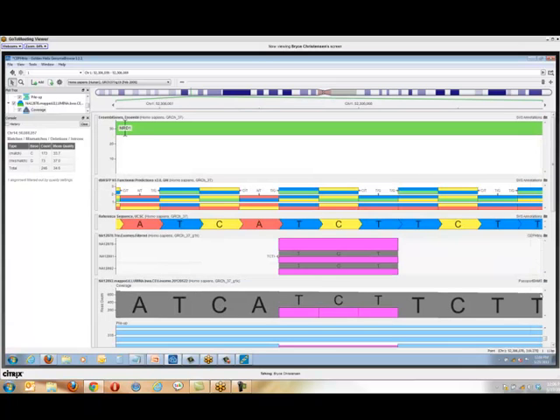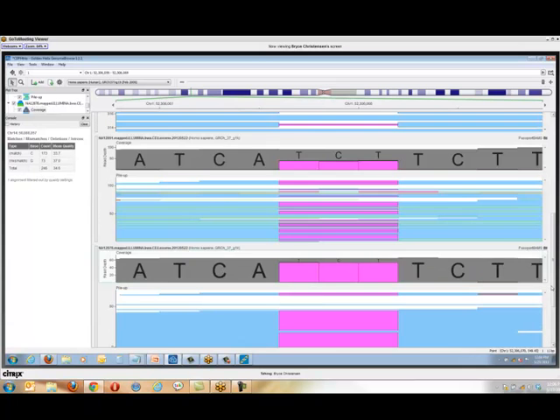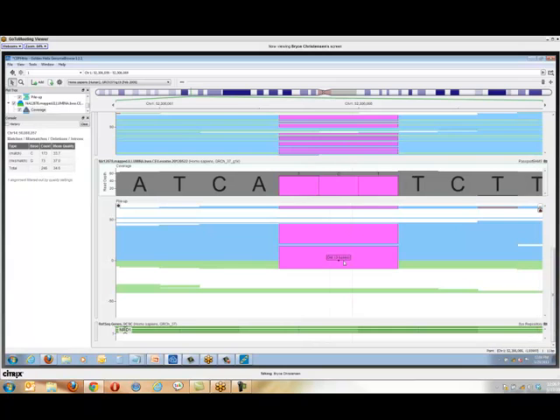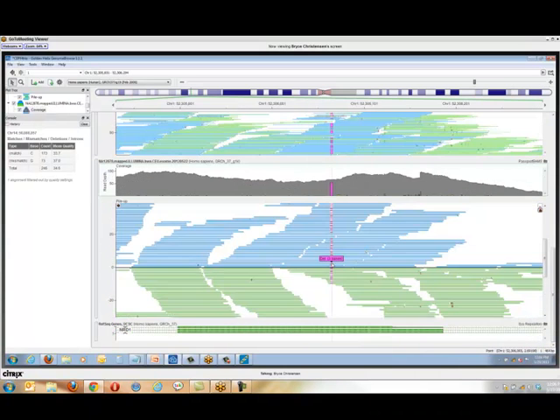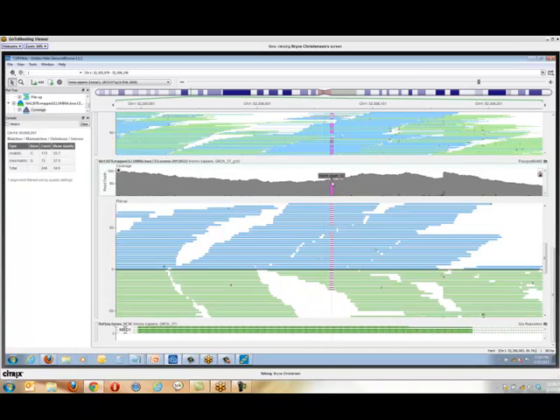And again, I'm having scroll bar difficulties. When we come down and look at the child has an interesting situation. So as we look at it, we can see up here in the histogram view that not all of the reads are consistent with the deletion, but the child was called as homozygous.